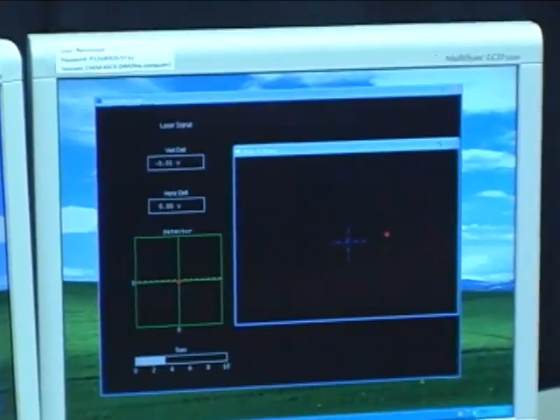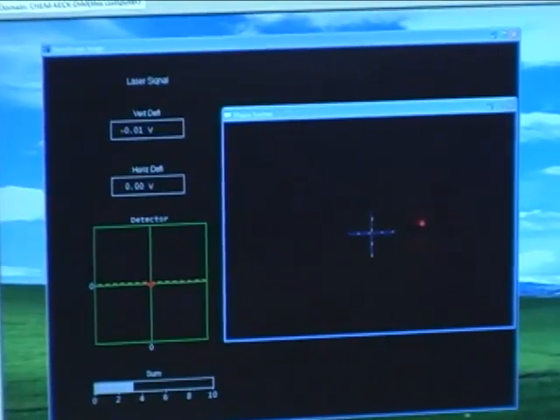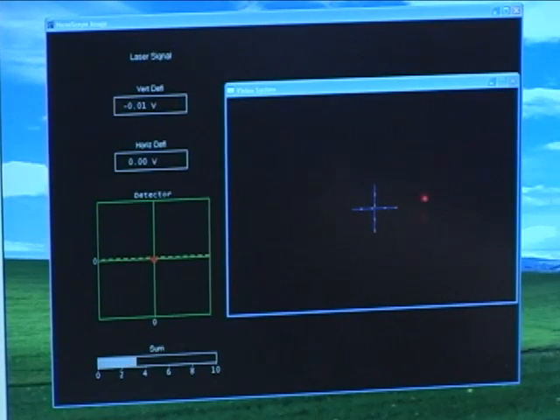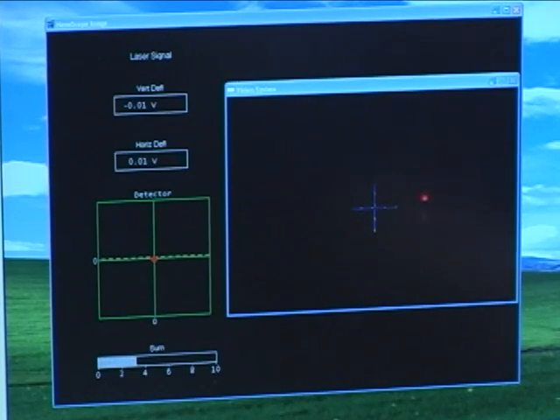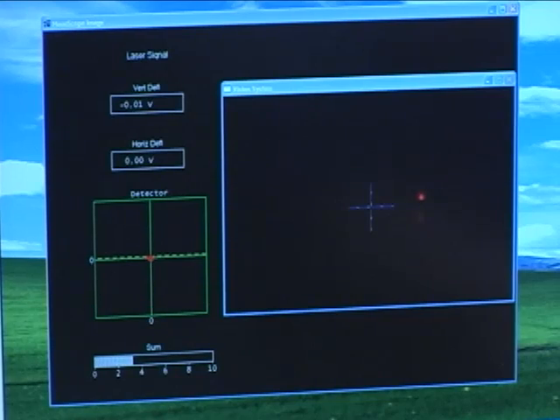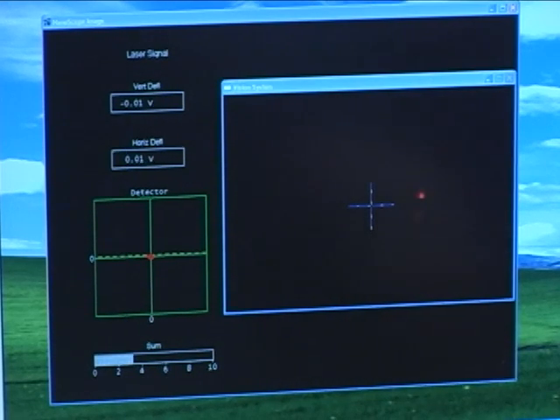So what I'm actually going to do is I'm going to engage the tip and it's going to come down and just sit at a point. Now, the reason that I do it this way is I want to do a series of electrical measurements. And my tip is a very soft metal and it's on a very hard abrasive metal oxide. And so if I come down and I start trying to image, I'm basically going to be rubbing my tip off and contaminating it. And I will do an array of those.